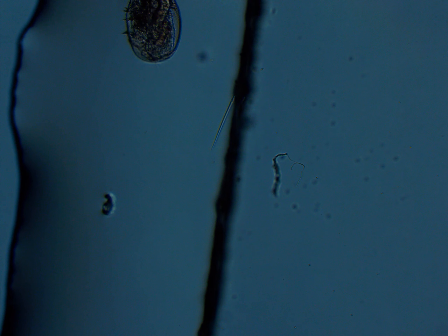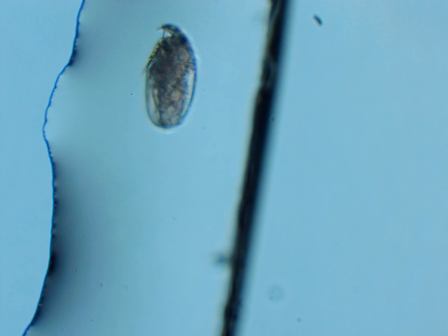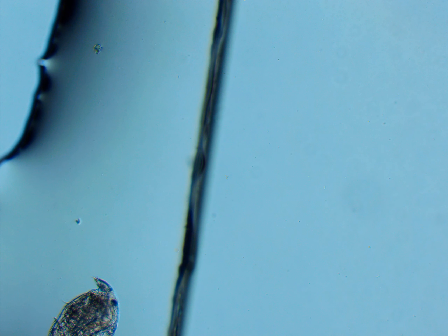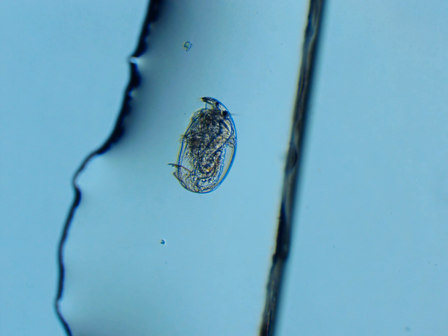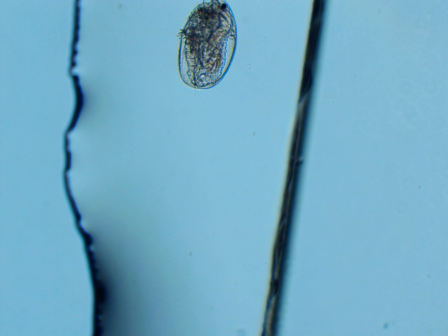Here is a freshwater crustacean called Chidorid. Chidorid is the genus — I do not have the species — but they're very transparent, unlike that ostracod, and you can see all of their organs moving.